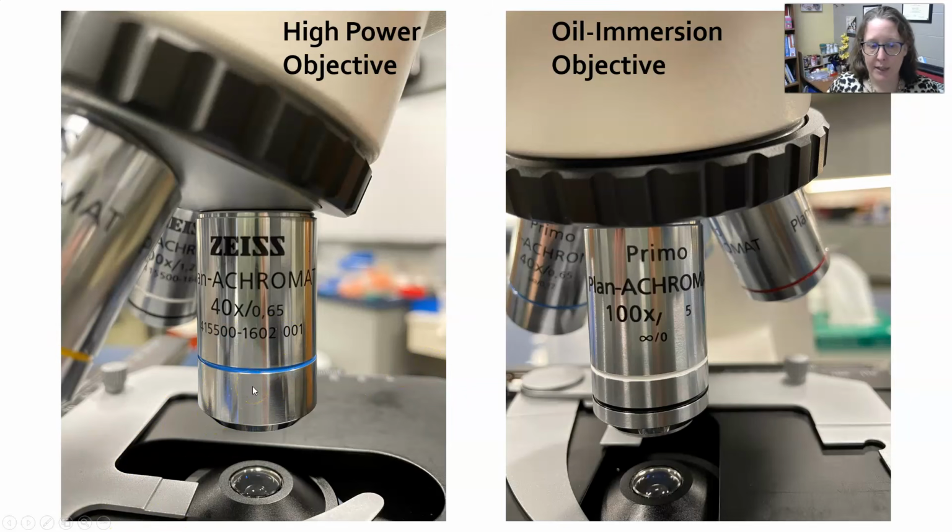So this is high power. This is a dry lens. You're not supposed to use oil with this objective lens. And then we have oil immersion 100x planochromatic here, and this one is white, and so you have to use oil on the slide to use this objective. So this is the oil immersion objective.